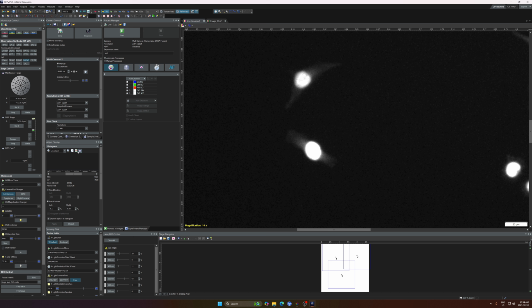And so beside the display setting, don't be confused with this and your data. This only affects the picture displayed on the monitor. For the device unit, normally we just leave it alone. Please don't change it unless we teach you how to do it and what you need to change. So we'll talk about this in the future.